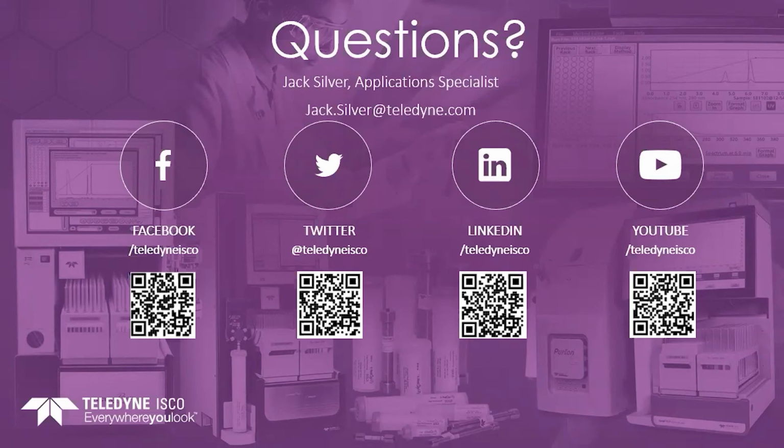Okay, we have another question about the focus gradient generator. The question is, do you have to use Teledyne ISCO columns for that? And the answer is no, you do not. You can use any manufacturer's columns and it works. In fact, we've run it with columns other than C18. We've run it with silica, and the customer had a diol column, and it worked very well. Some people have even used the focus gradient generator to come up with initial conditions for chiral columns.